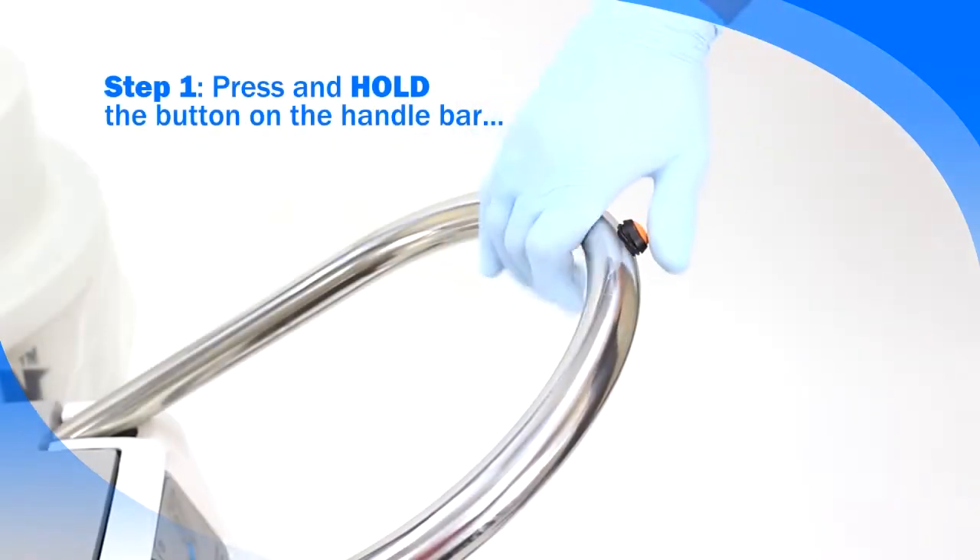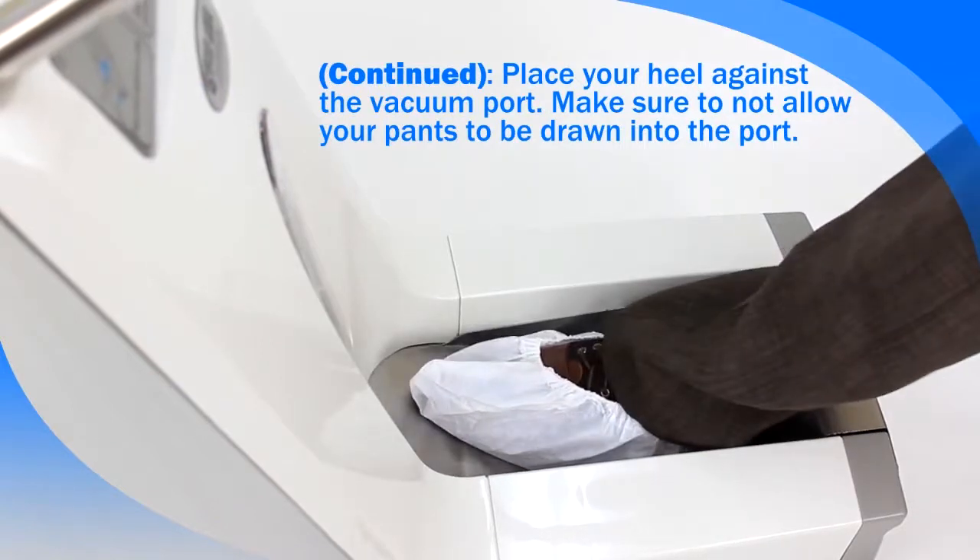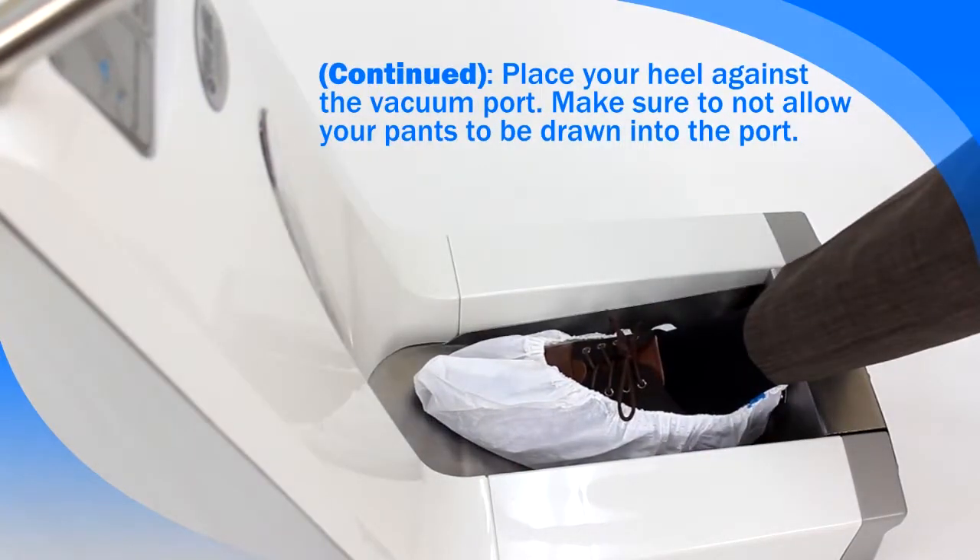Step 1: press and hold the button on the handlebar and place your heel against the vacuum port. Make sure to not allow your pants to be drawn into the vacuum port along with the shoe cover.